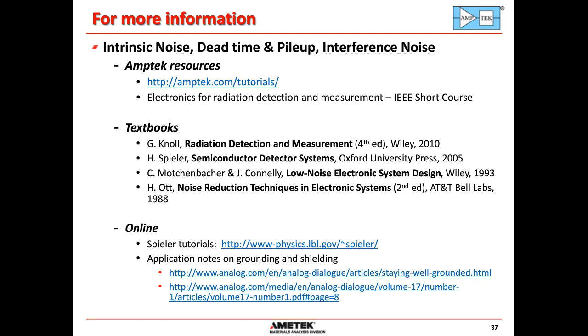Okay, I've got a question about the difference between the fast and the slow channels. Think of them as two parallel paths of signal processing electronics, two parallel shaping amplifiers, basically different bandpass filters. The slow channel is one that has a relatively long peaking time. What that does is filter the noise most effectively, so it's optimized to measure the pulse height as accurately as possible. But the problem is it will be affected by pulses that pile up or overlap in time.